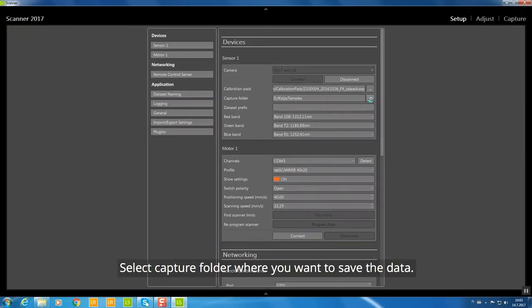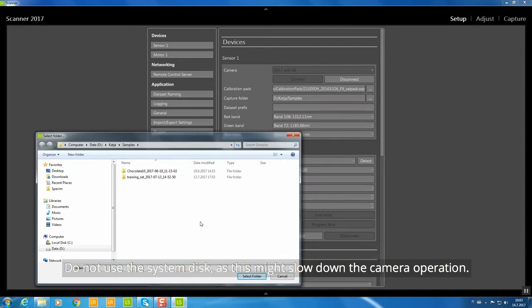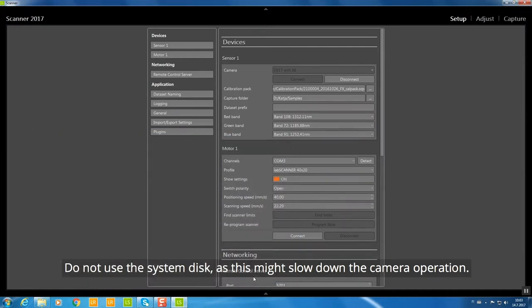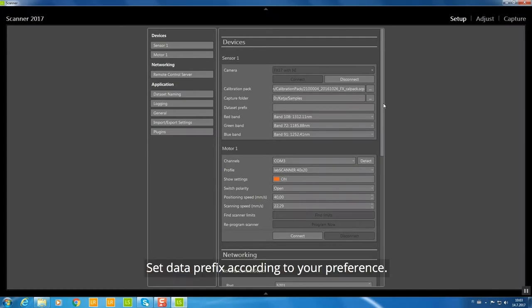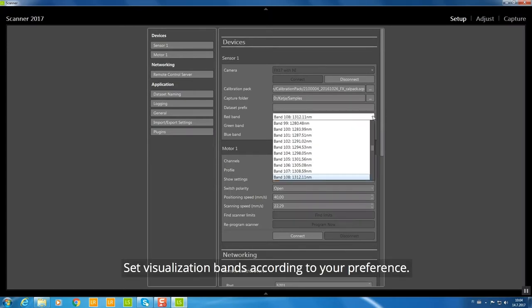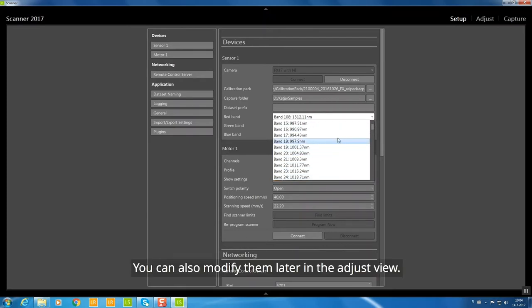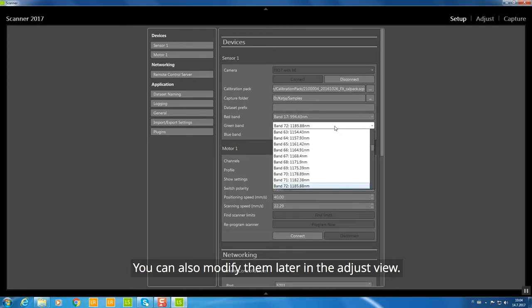Select the Capture folder where you want to save the data. Do not use the system disk as this might slow down camera operation. Set the Data prefix and Visualization bands according to your preference. You can also modify them later in the Adjust view.